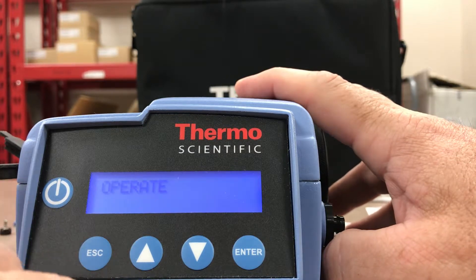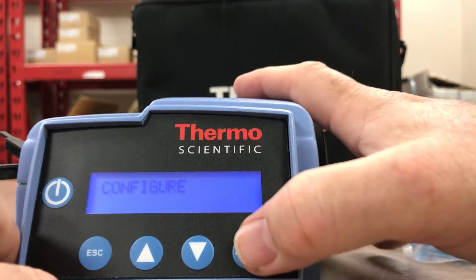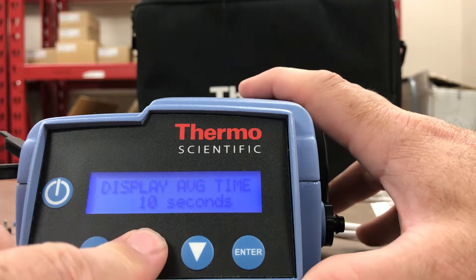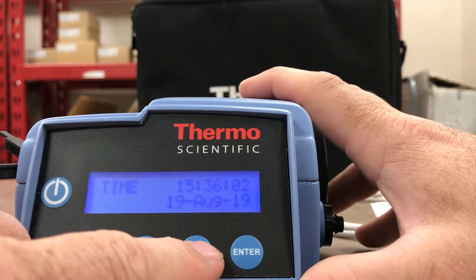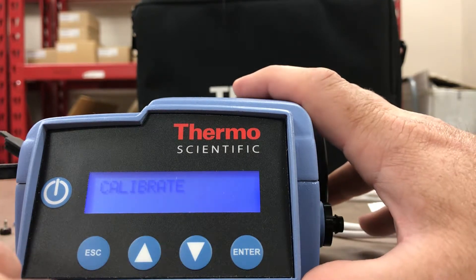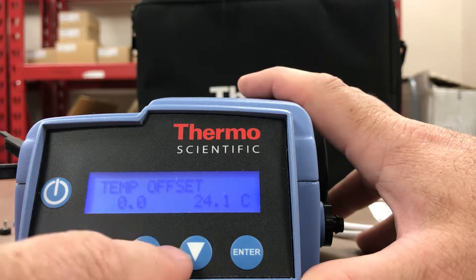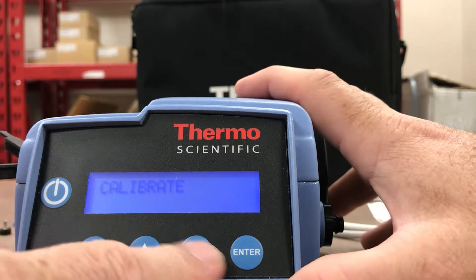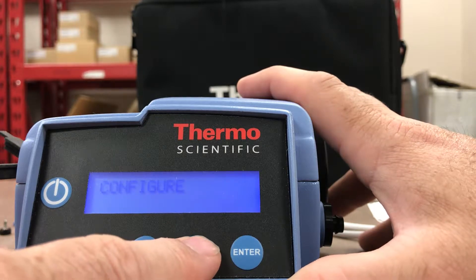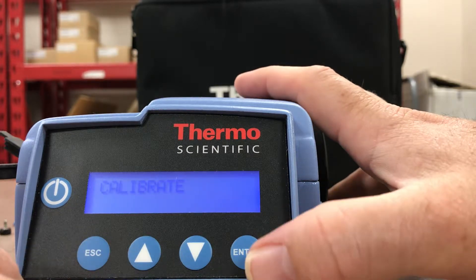So we can scroll through the menu a little bit. This is the Operate menu first; go down and we have a Configure menu. Looking in here you can display the averaging time. There's also a Calibrate function — going back: Configure, go down, there's Calibrate. And then back to Operate.